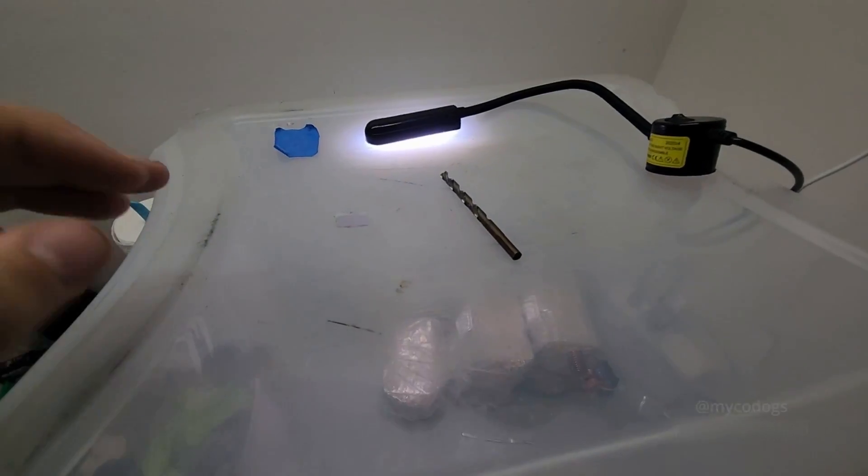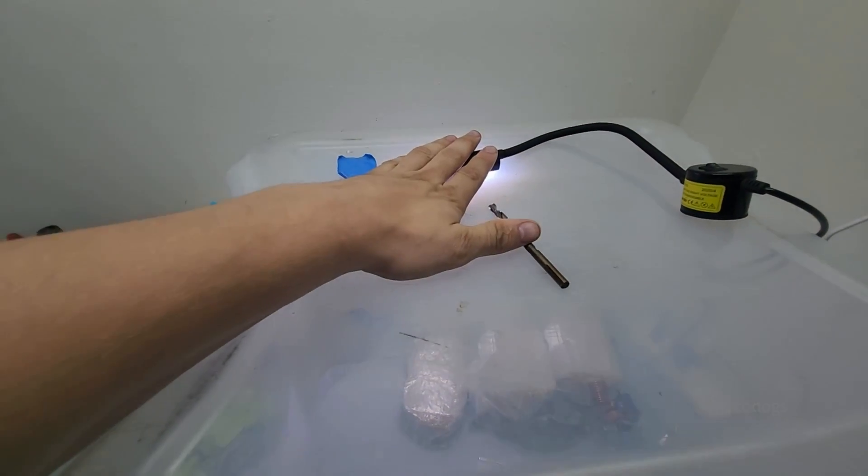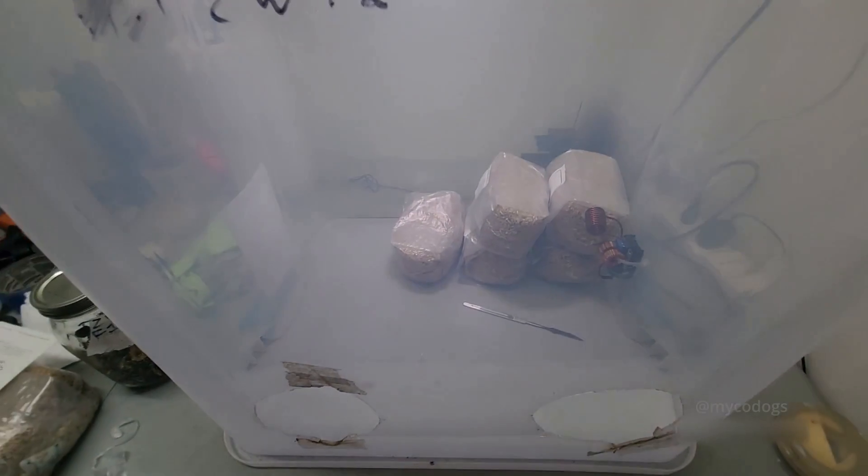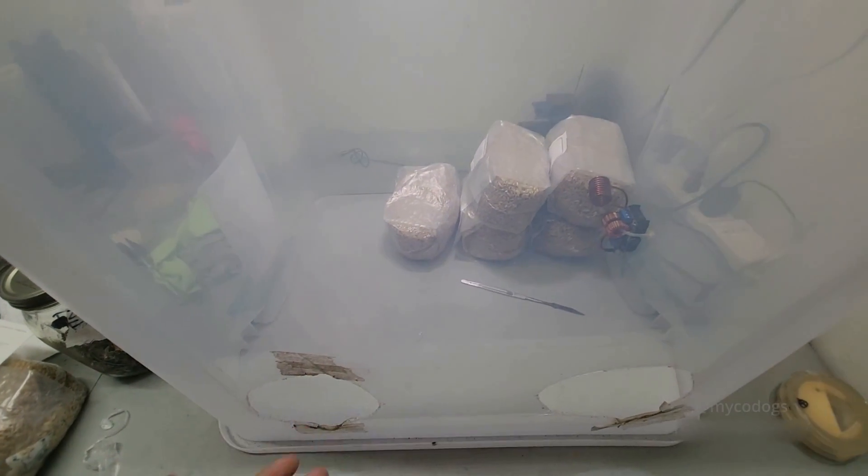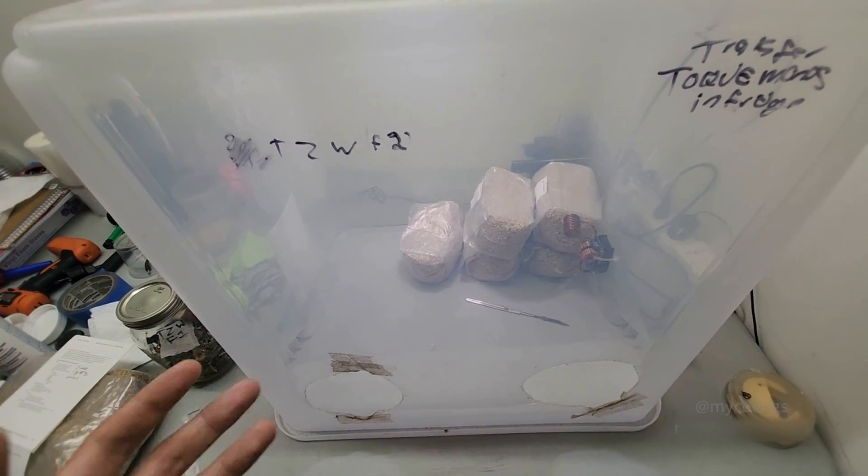Another very important thing for working inside a still air box is having good lighting. I use this very bright LED light directly on top of it and that illuminates my workspace pretty well. I also have this light directly above it, which also illuminates what I'm working on quite well.